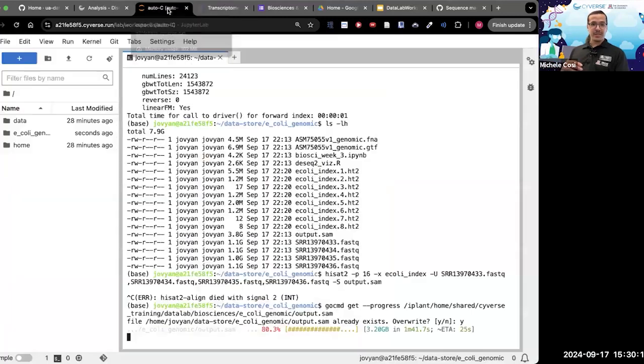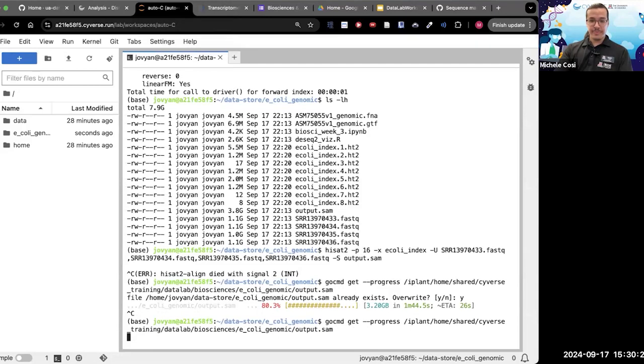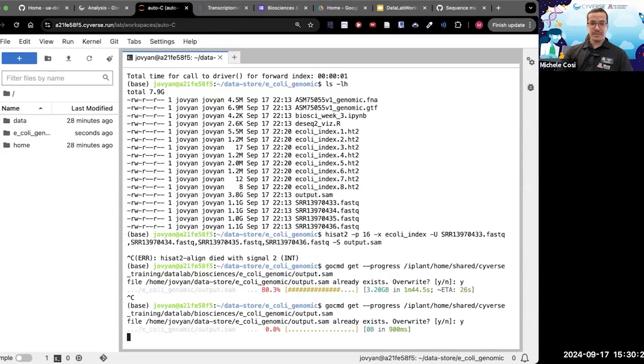I'm going to go back to the Jupyter over here, which seems to be stuck. I'm just going to press yes over here. And if it gets stuck at 80.3%, I'm just going to restart it again.